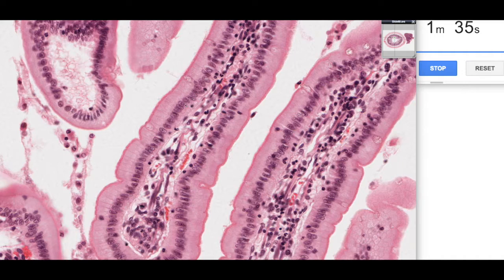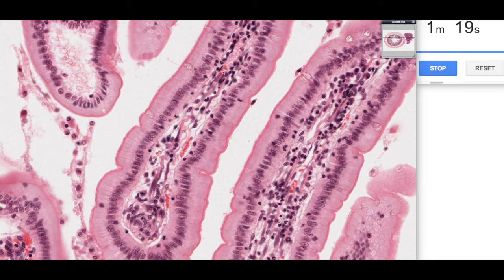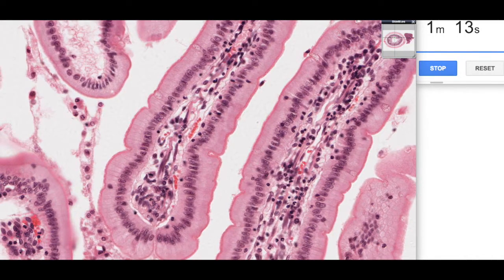These nuclei lined up in a row represent the enterocytes — the cells responsible for most absorption within the small intestine. Whatever they absorb is passed into the underlying loose connective tissue or lamina propria, which contains smooth muscle cells, lymphocytes, various immune cells, and of course our capillaries and lacteals, which receive the fats being absorbed in this area.